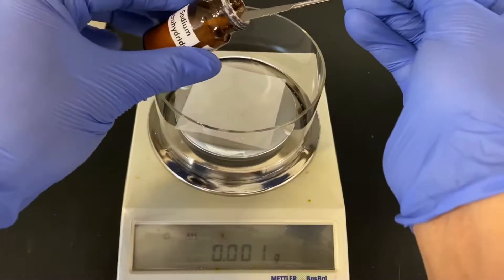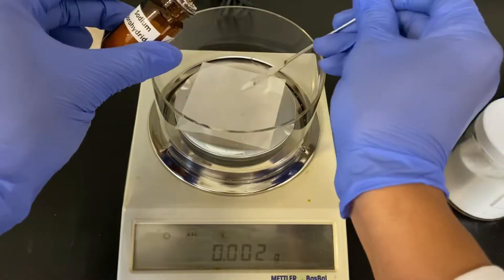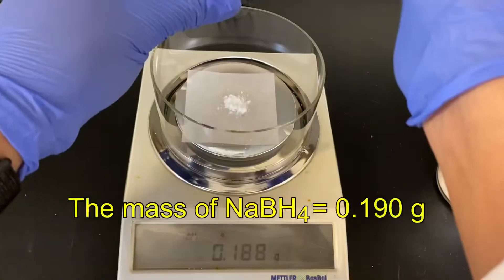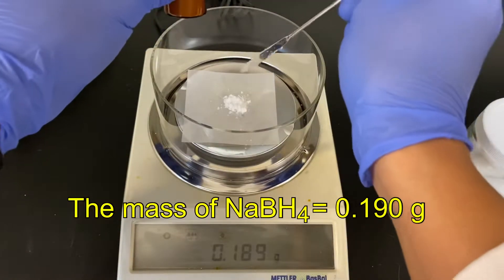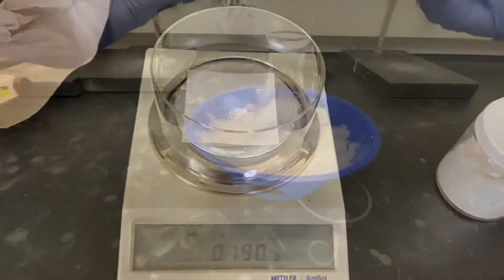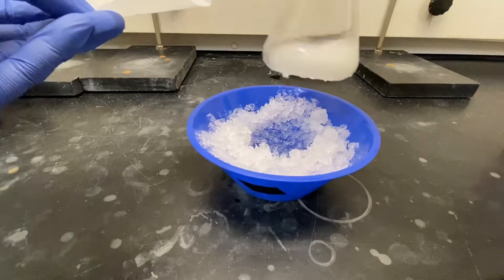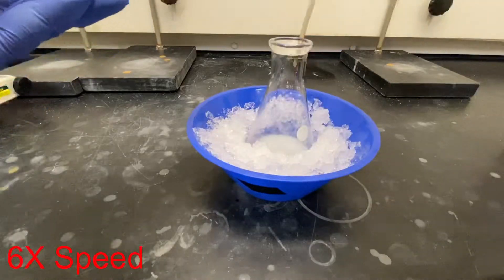While the mixture chills in the ice bath, mass the reducing agent, sodium borohydride. The mass of sodium borohydride used was 0.190 grams. Add the sodium borohydride in portions to the chalcone mixture. Swirl to mix during the addition.